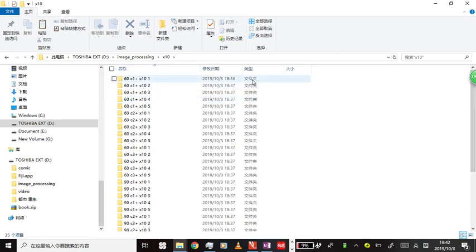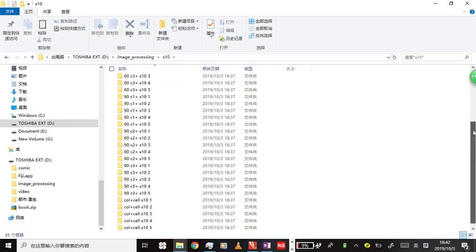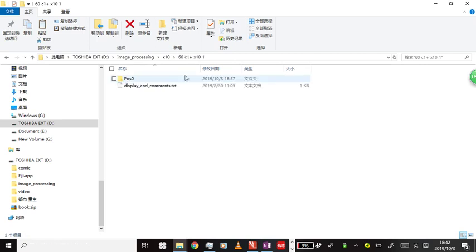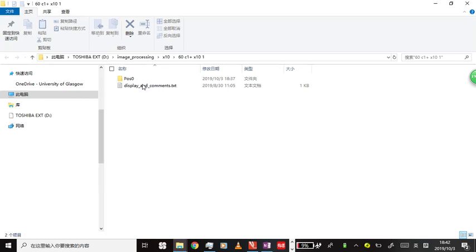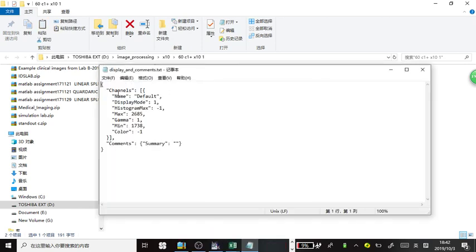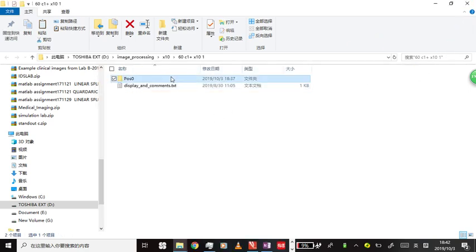And such sets of names, though they follow a kind of pattern, still cannot be fit into the loop for macroscript in ImageJ. You can open one of the images. You can see there's a description given by the microscope saying how these images were taken, and the images of different channels.